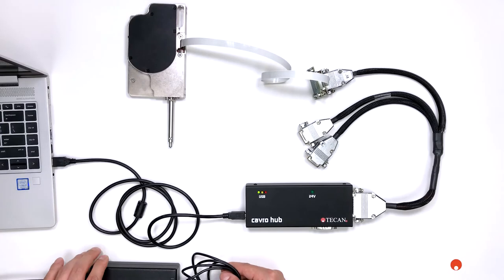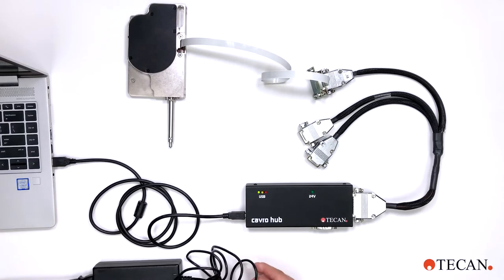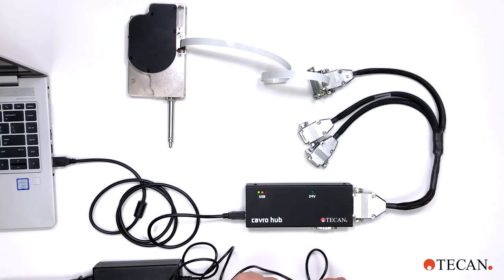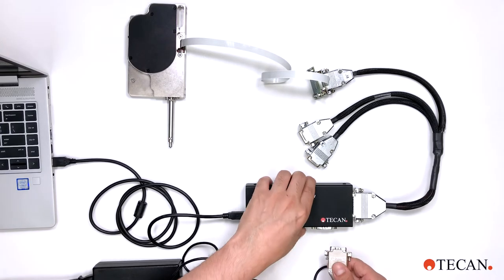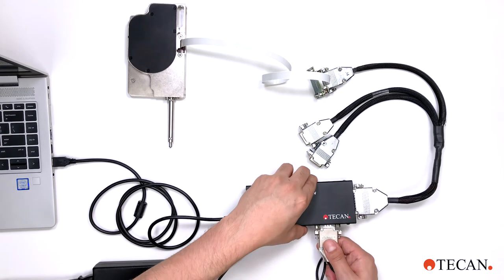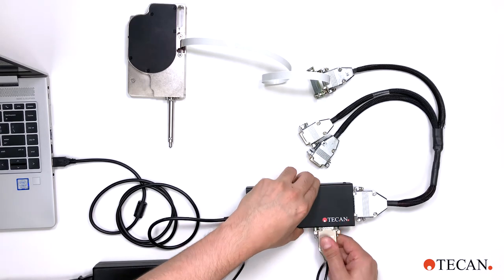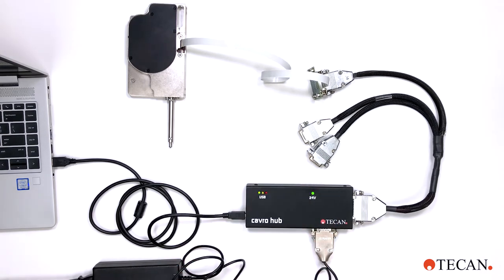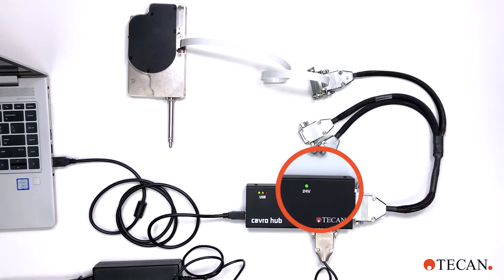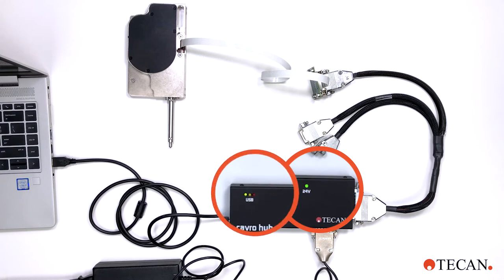Now let's make the power connections. Plug the power cord into the CAVRO hub and then plug the power supply into any standard outlet. A light on the CAVRO hub indicates the power is on. Another light on the hub confirms communication with your PC.